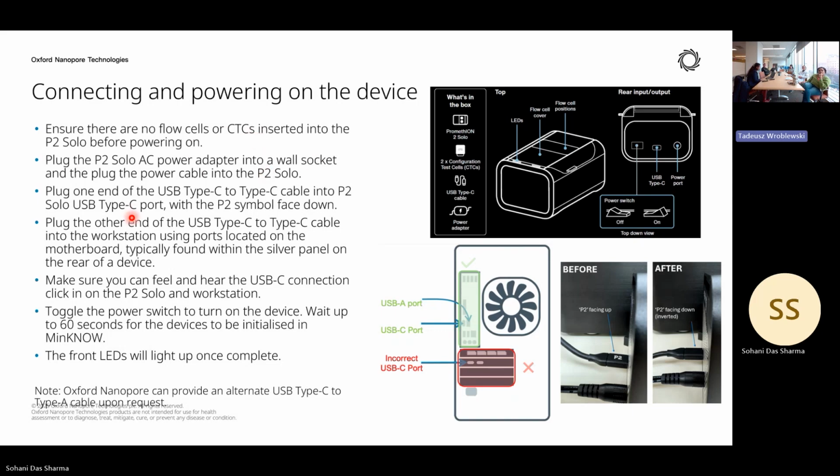So, and what else? There is a USB Type C to Type C cable into the P2 Solo USB Type C port. And they say this is very important: the P2 symbol should face down. So these are the things with P2 Solo.